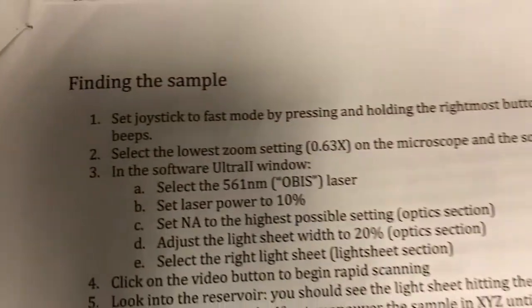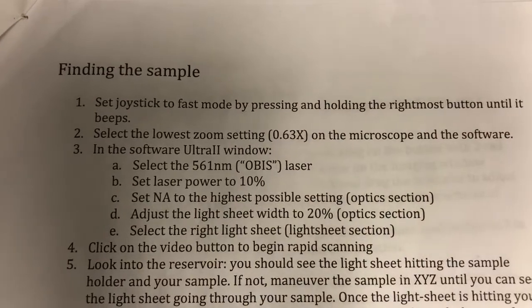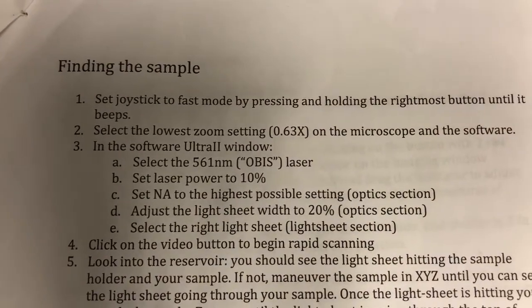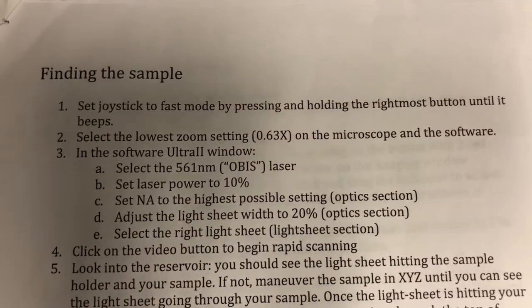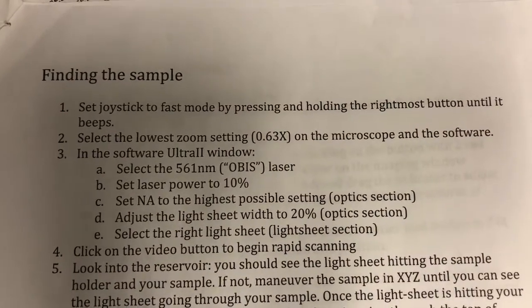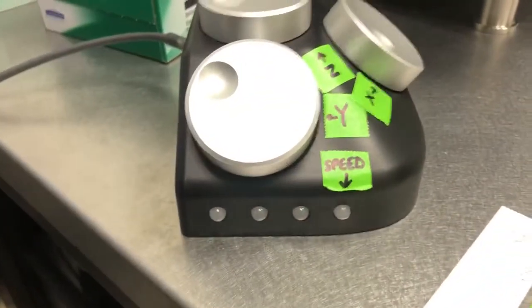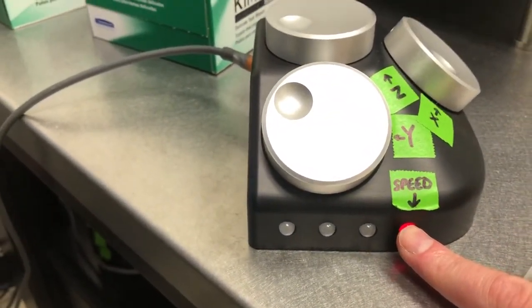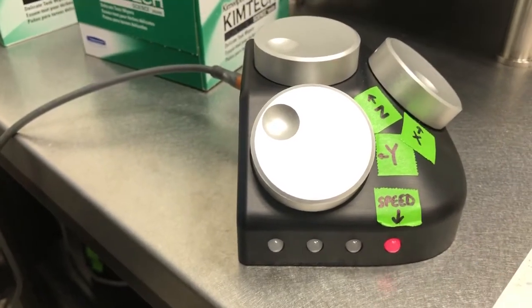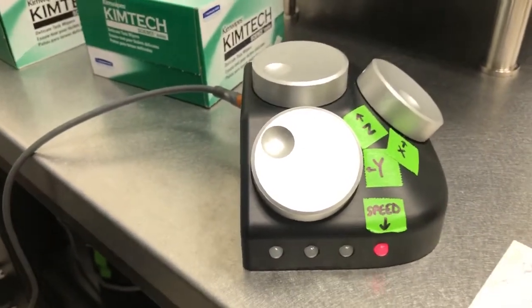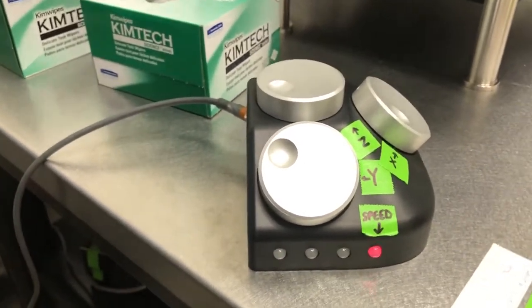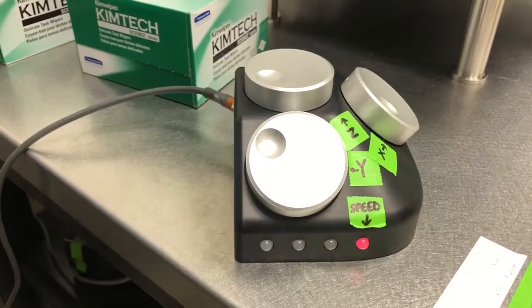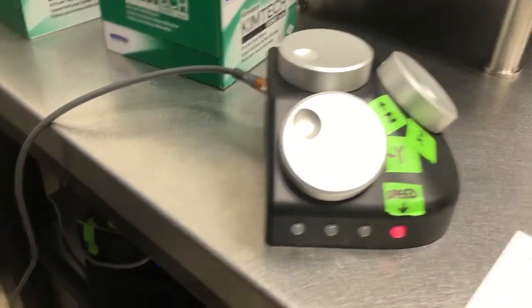Step one is to set the joystick to fast mode by pressing and holding the rightmost button until it beeps. I've already shown you how to do that, but let me do it again. I'm going to press and hold this — now it's blinking quickly. The reason we do that is we want to be able to move quickly when we're at the very beginning of the setup procedure.